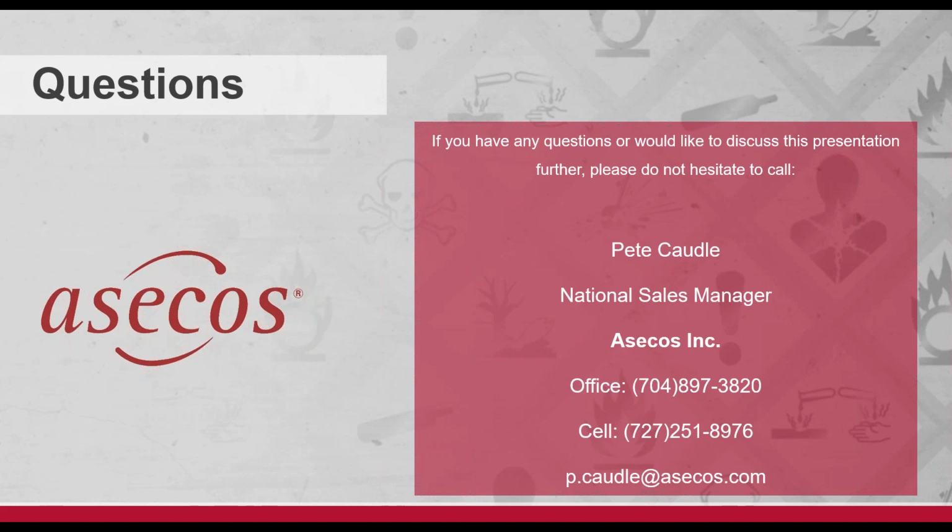That's a great question. All right. Next question from Robert Bonin. If you ventilate a cabinet, does it have to exhaust direct to outside for each cabinet, or can it go into the exhaust used for the fume hoods? What code covers this? I perhaps interpret this as how you connect your exhaust from the cabinet to the other exhaust sources in the lab. Correct me if I'm wrong, but I take that as well. That's a good question.